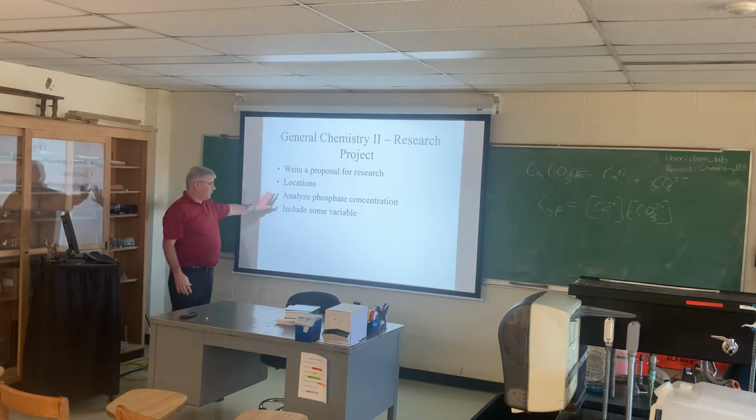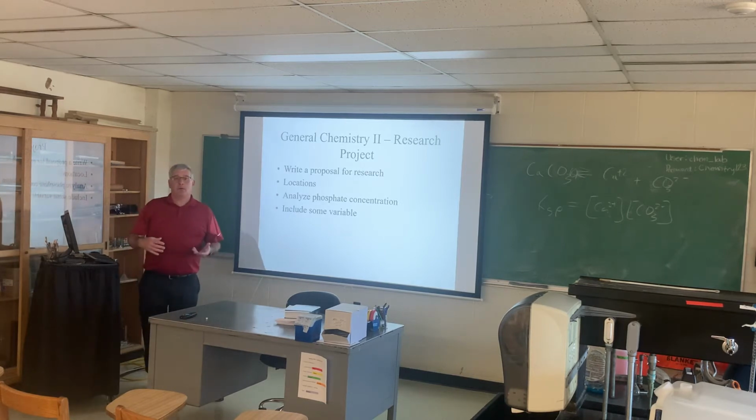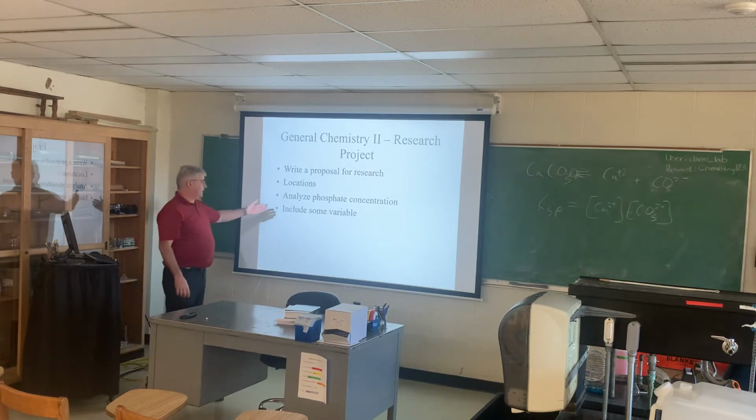And we're going to include some kind of variable, maybe two different streams and a confluence, or where a wastewater treatment plant is, above and below where the confluence from the wastewater treatment plant comes into another system. So if you sampled above and below where that interface is, then that would be a nice variable.